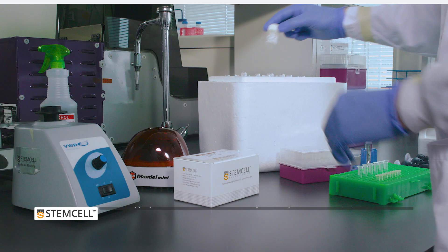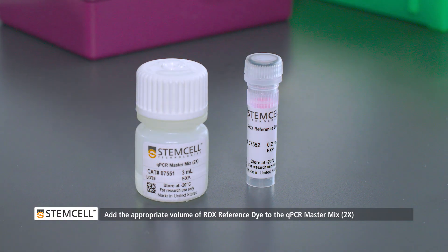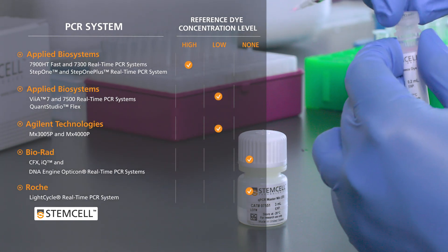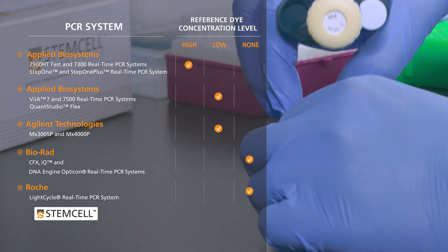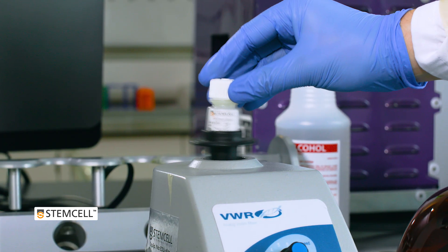First, prepare the qPCR master mix by adding the appropriate volume of ROCK's reference dye. The volume will vary depending on the qPCR machine being used. Mix the solution thoroughly before use.